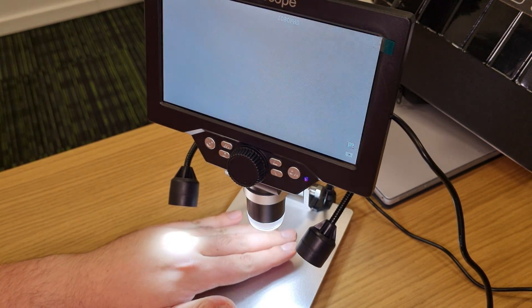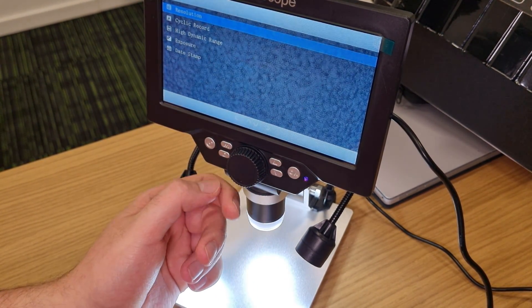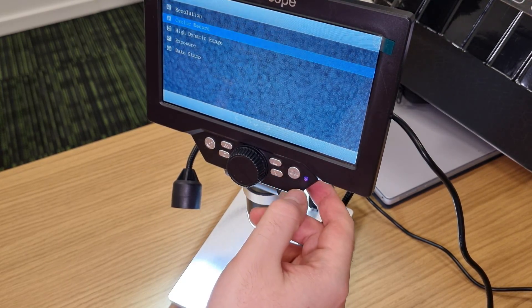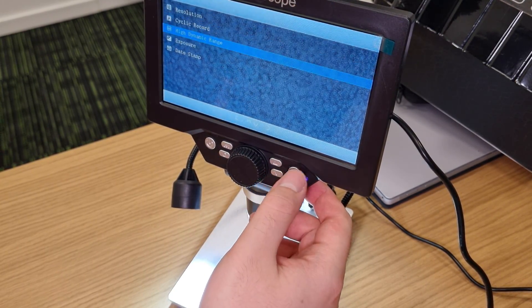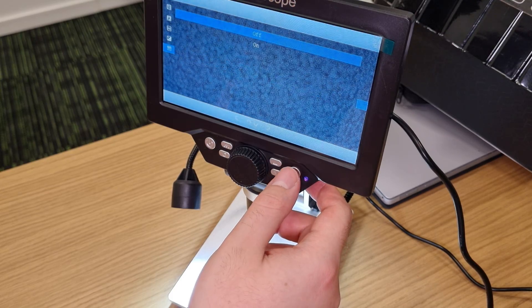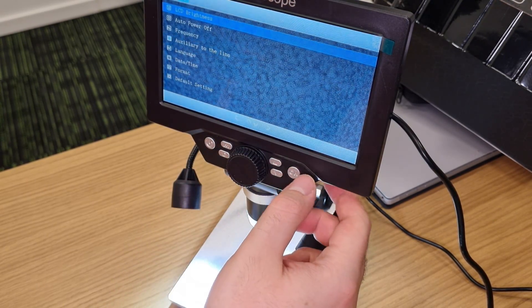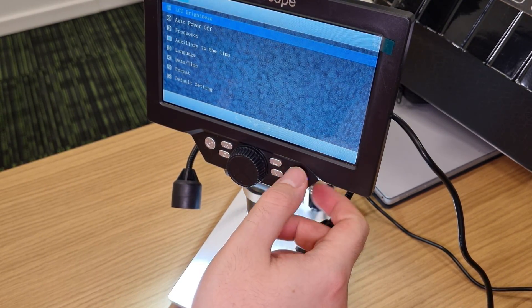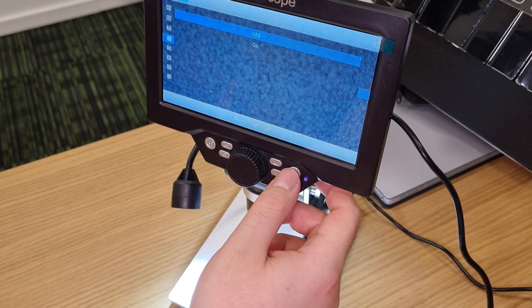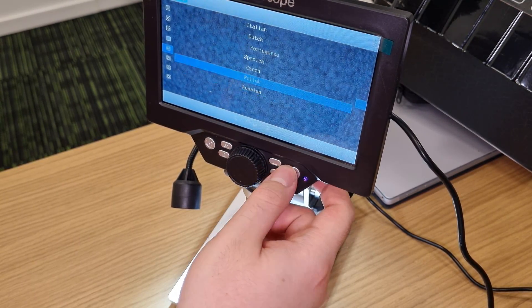The refresh rate is fine. Let's click something — wow, there's a menu. There's resolution, cyclic record, exposure, date stamp — who would need that — and a lot of options to be honest. I'm thinking about what would really be needed. There are also language settings.